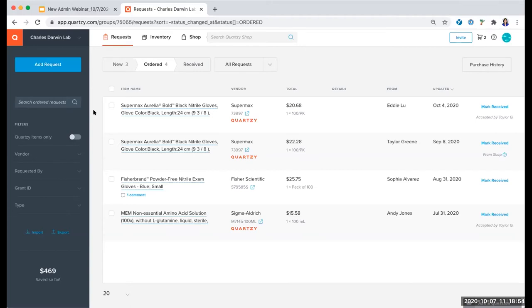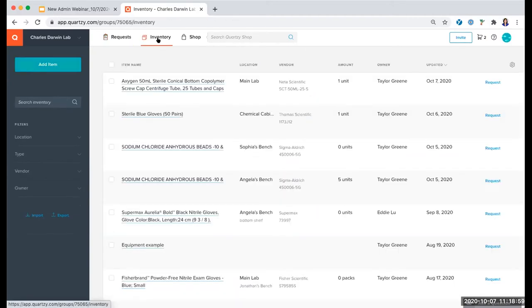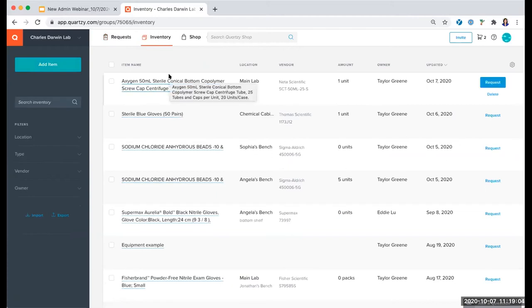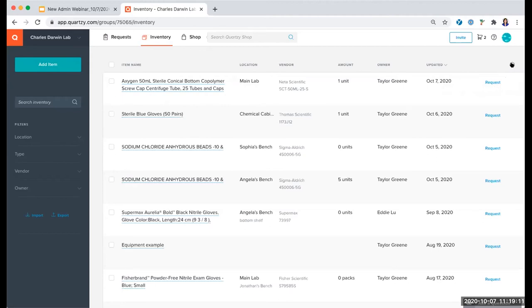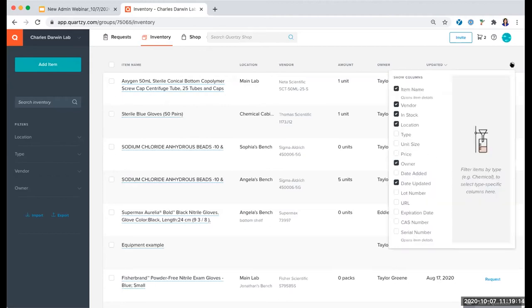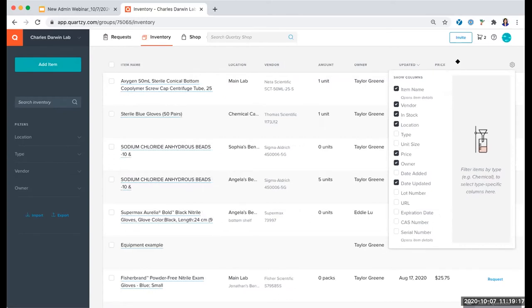We will go ahead and head into the inventory module. You'll notice that this page looks quite similar to the request module, with rows going all the way across the page so you can view all the information you want about your items. You can customize the columns by clicking the gear icon and adding other columns you'd like to view, like price for example.